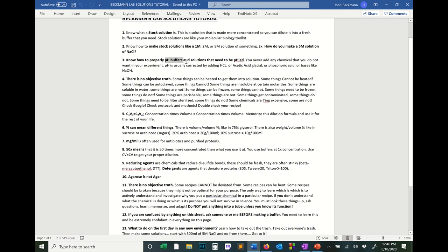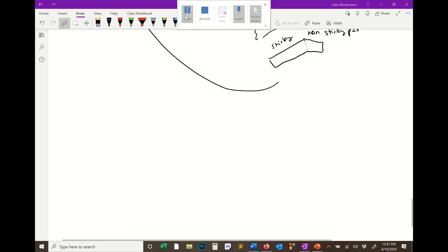If you don't know about pH, I'm not going to talk about it here. Again, you need to pull out a chemistry book and read about pH. But what I am going to talk about is the things that we need to do to solutions to make sure that the pH is controlled properly. Okay, so let's talk about that.